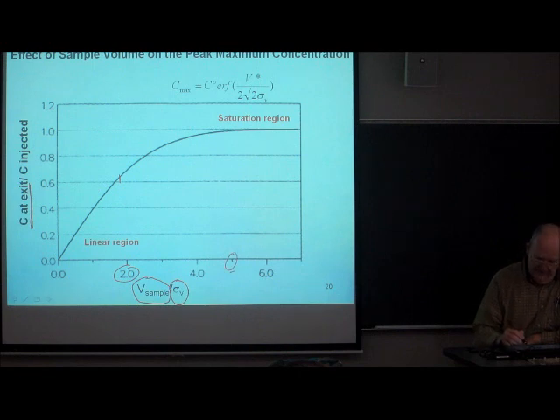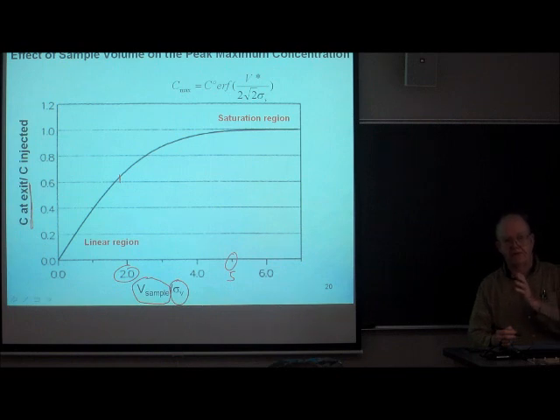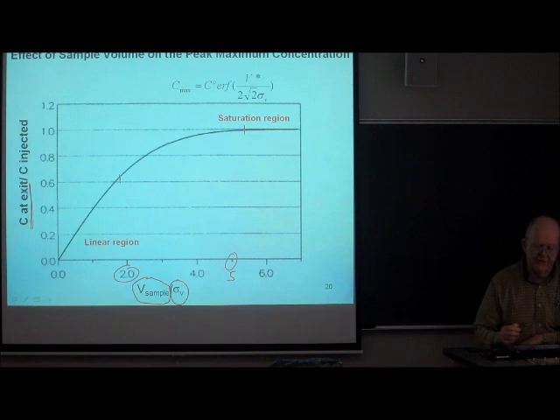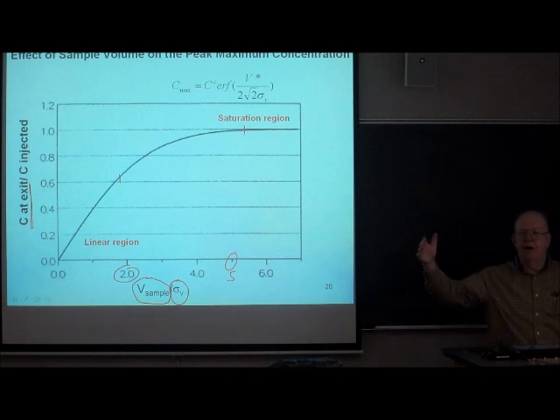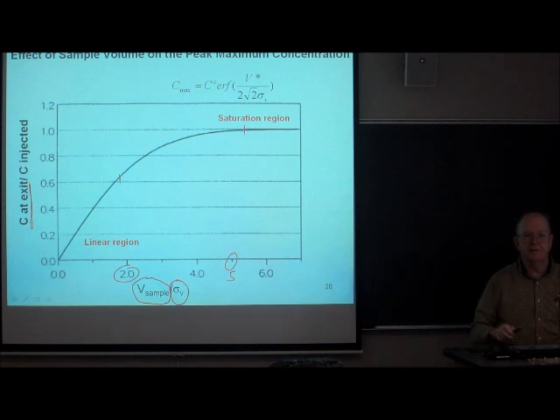When you're injecting about 5 times as much volume as the sigma V of the peak, this curve is essentially flat. You get no further increase in the concentration at the peak maximum. The peak simply gets wider and wider and wider as you inject a bigger and bigger volume. The plateau gets longer, if you will.